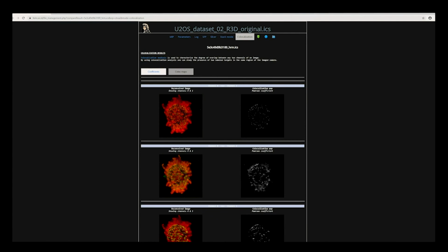now in the browser. So I think this is a nice page to show you how you can first assess the results of the deconvolution, and whenever you're interested in doing more analysis, then you can download the data to your local computer to do further analysis or visualization and so on, right?